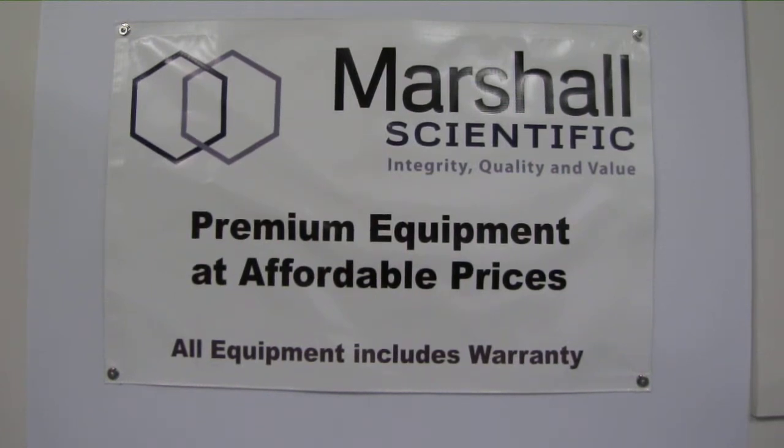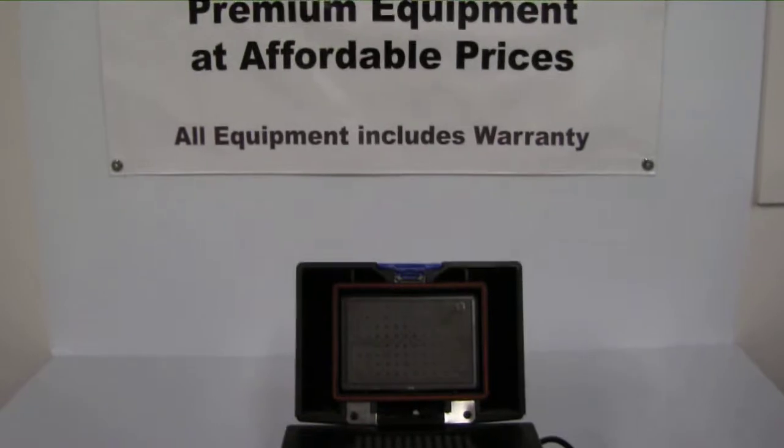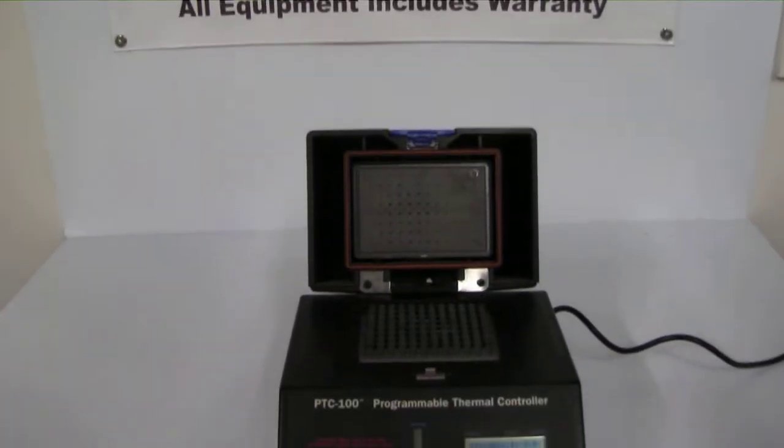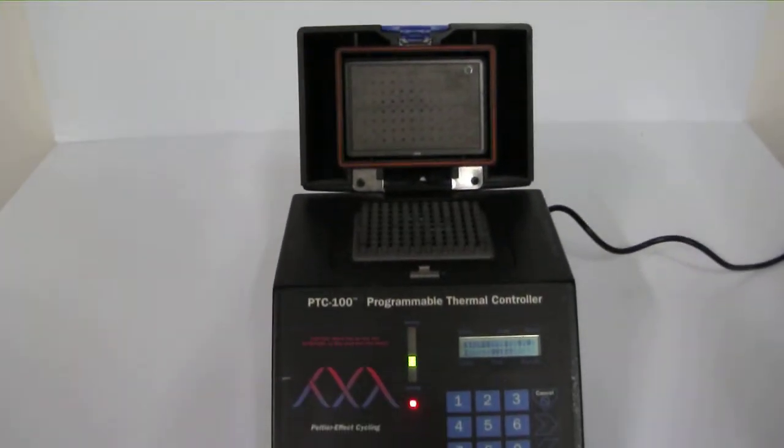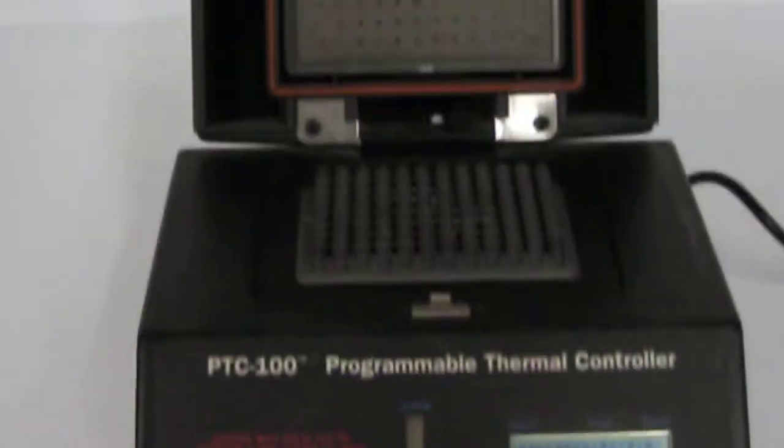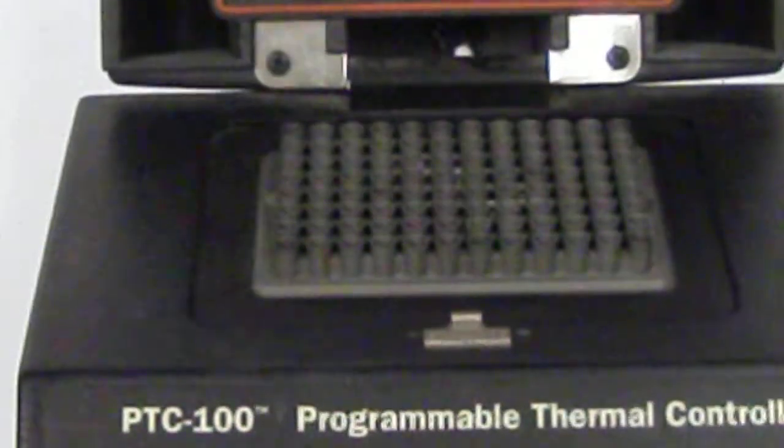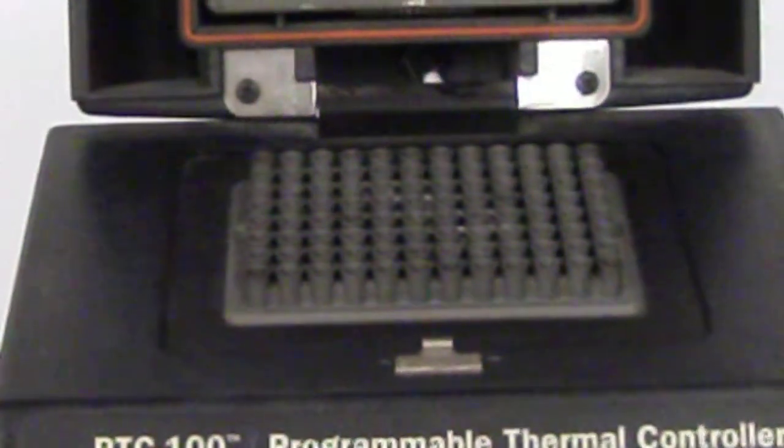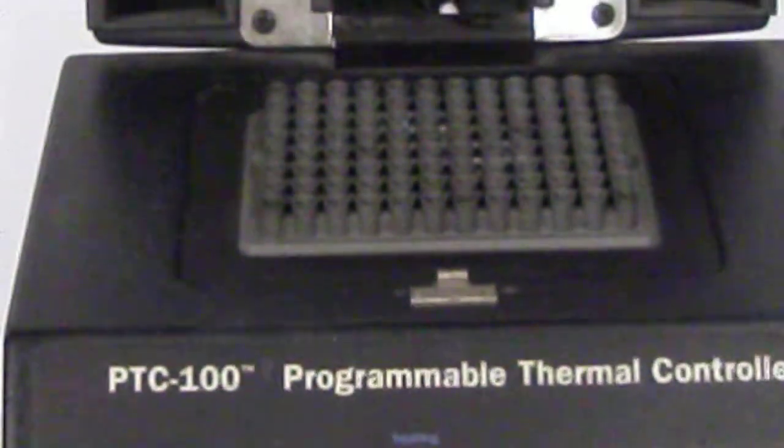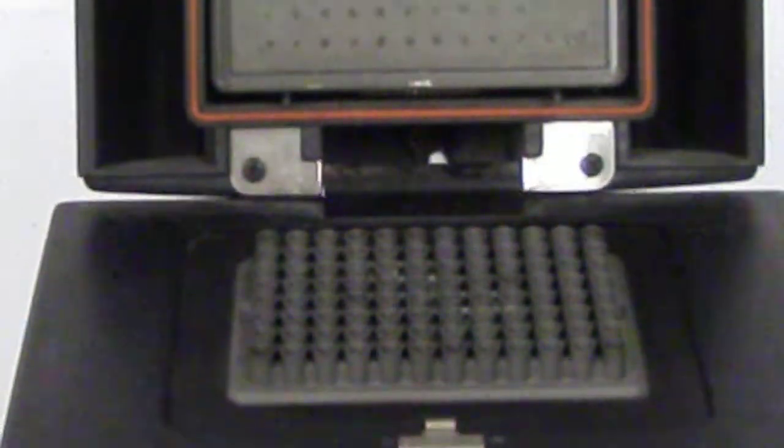This MJ Research PTC100 Thermocycler will meet and exceed your needs for a versatile, reliable, and compact programmable thermal cycler. The MJ Research PTC100 is a 96-well thermocycler that also uses a heated lid for oil-free operation.